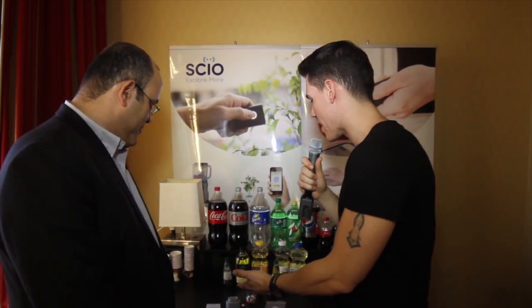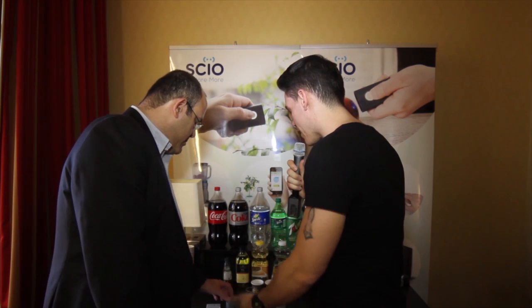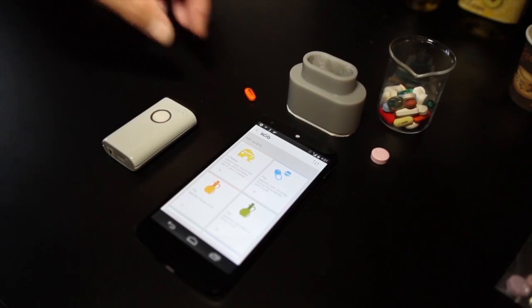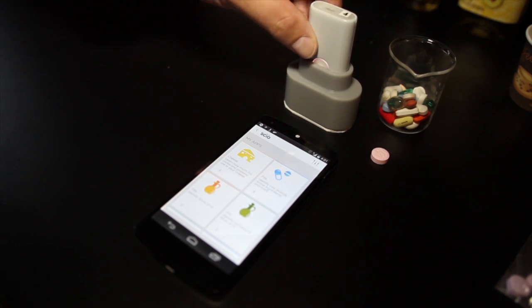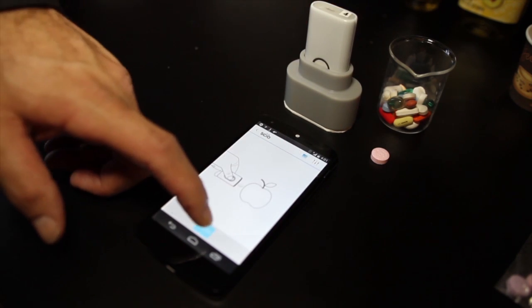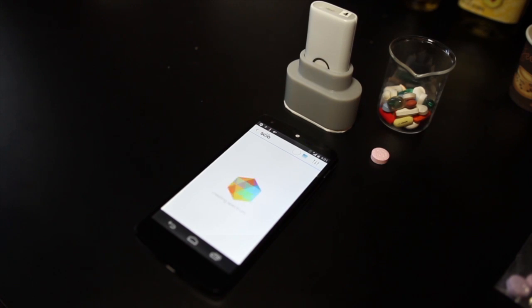We're actually going to do a demo right now. We've got a pill here — go ahead and walk us through exactly how it works. So we take a pill, drop it into this little pill box, put the scanner in there, choose the right application, press a button. It scans in less than two seconds, creates a fingerprint, sends it to our cloud, it's been analyzed, and the results come right back — it's a Motrin IV. Boom. Motrin. Perfect.